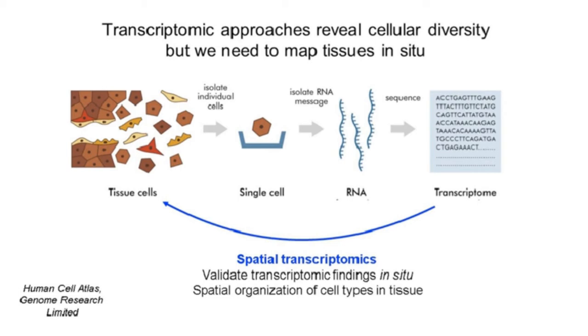As most of you are well aware, the past 20 years have seen an explosion of transcriptomics. Most of these methods dissociate tissues to purify cells of interest. We now have an incredible amount of data describing cell type specific gene expression patterns in healthy tissues, as well as gene expression changes in diseases. Single cell RNA-seq is becoming more robust, pretty much every week. We can sequence larger and larger cohorts of cells at lower costs.